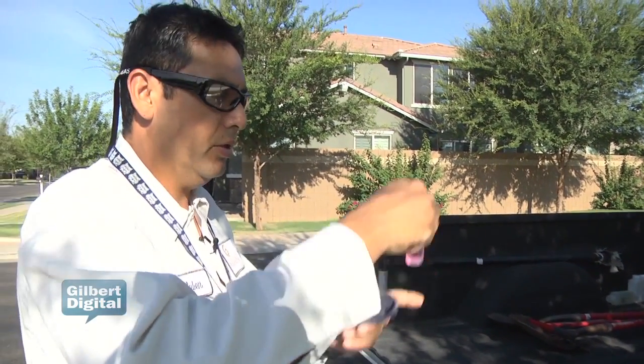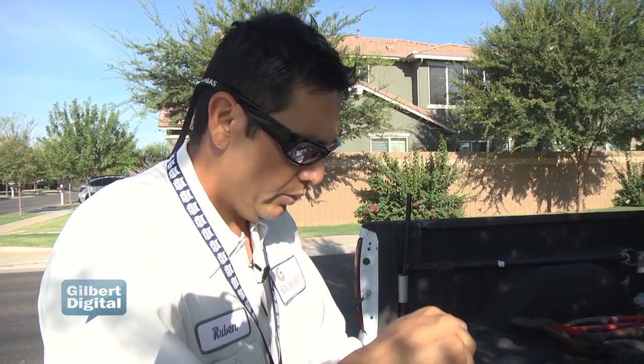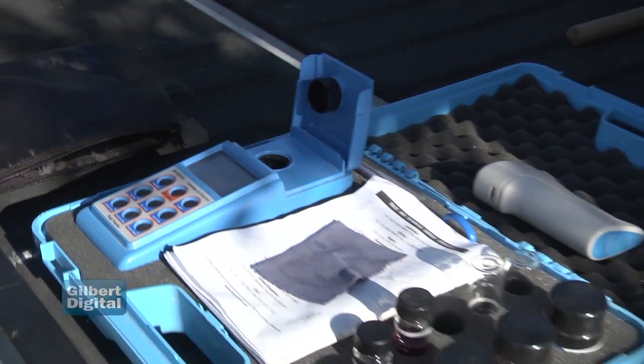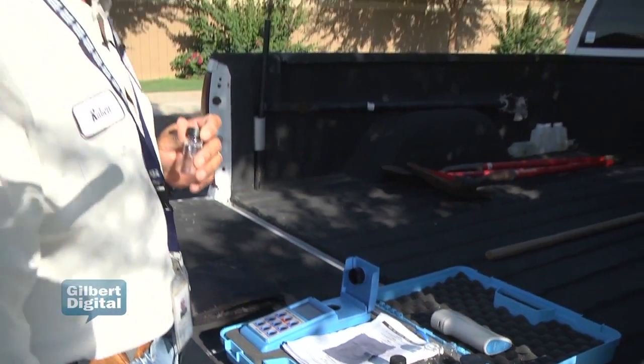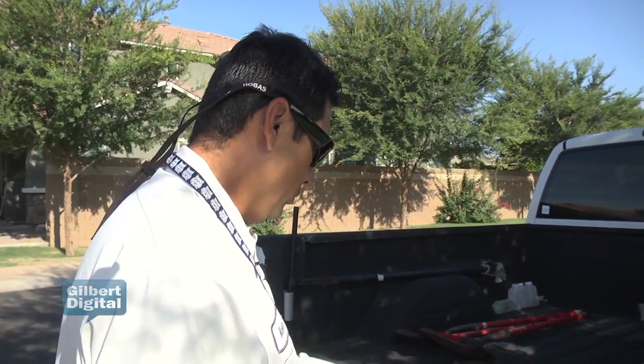Purple-ish color with our residual, so it looks like it's gonna be a good residual. The range should be between 0.20 and 2.20, so this is more like a mid-range — it's a pretty good range.